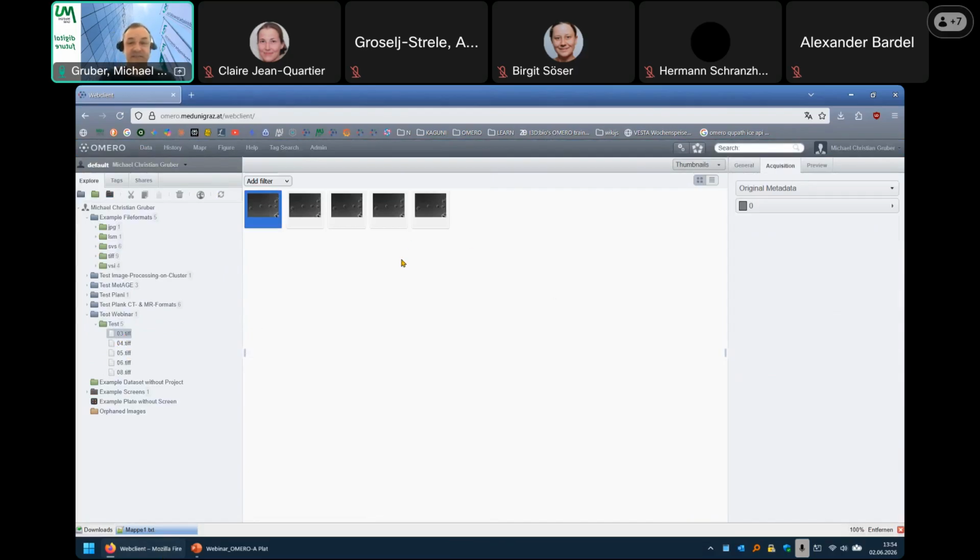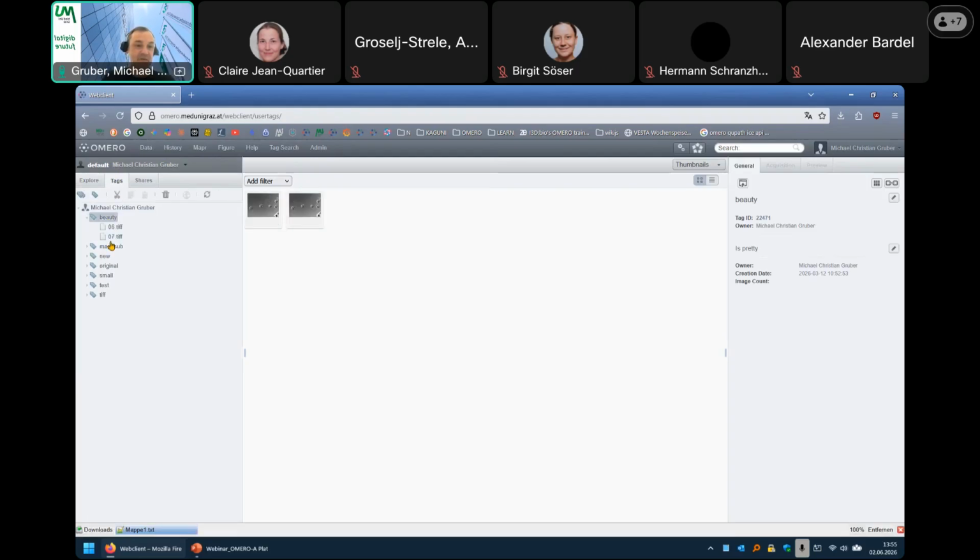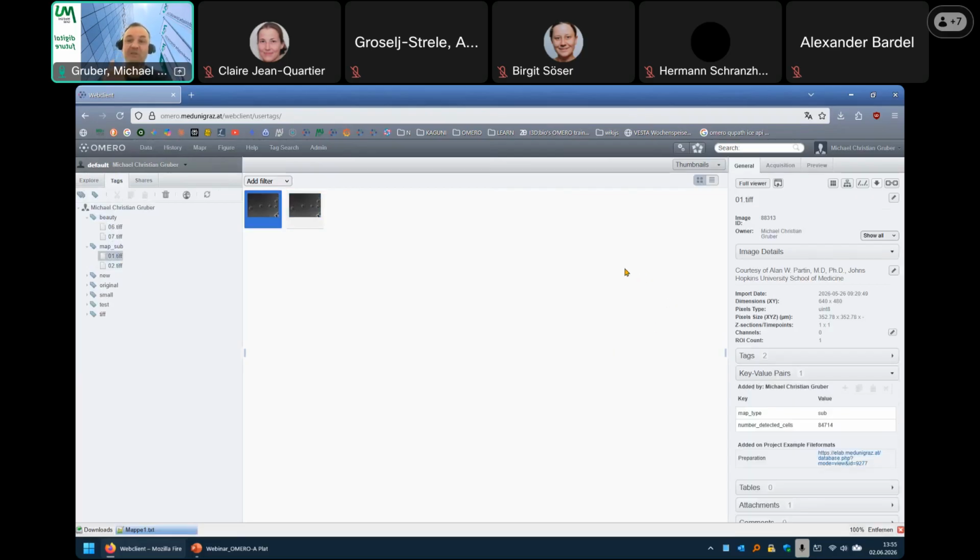So what else is there to say? For example, here I can see history. It helps me to see when data was imported. There is also the possibility to see, for example, which tags are already used, in order to help me to structure my data and make it searchable.